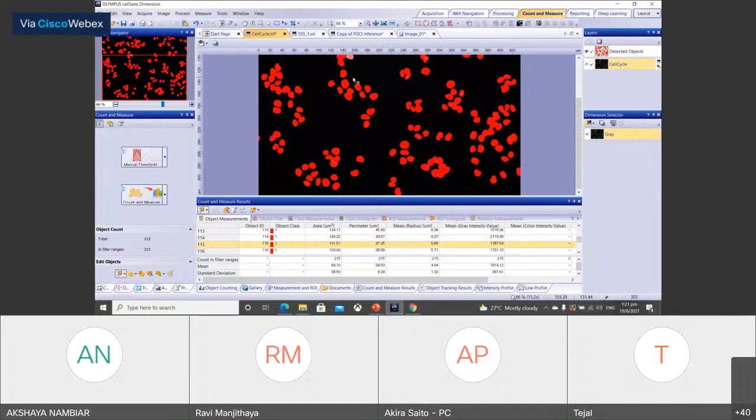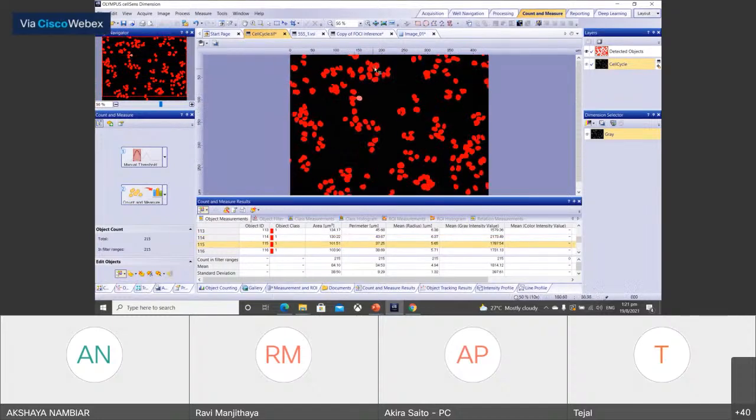Yes, sorry. It is split. The nuclei are split, and each is a single nucleus like this.